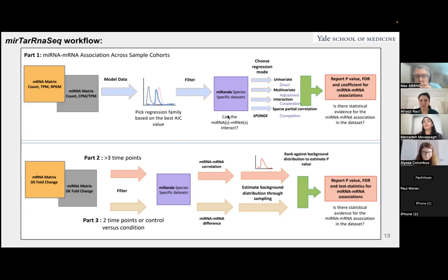And so when you're saying what you run your model on, you run it on the data set itself, because that's the whole point of it. The whole point is basically to fit a model that is best for your data set. So what we do is this analysis of microRNA, mRNA regressions across all the data set, because they're 1-to-1 relationships or 2-by-2 relationships or 3-by-3 relationships.